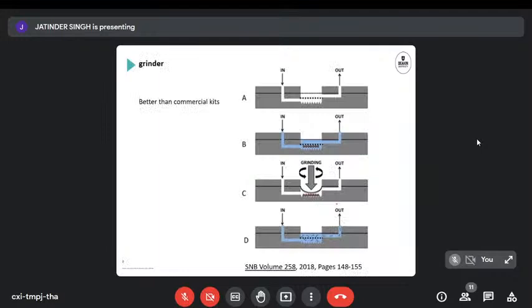What they will probably do in your medicine department, biotechnology, is grind things together. I think it's pottering that's called. I remember doing it in undergrad experiments with a weird buzzing instrument. So we put a lever in and we move the thing up and down, pretty much like a stick mixer. And it did grind all the cells apart to bits so that the cells would release their contents. Grinding has also been demonstrated on the microfluidic format by having a cell created with sharp saw teeth at the bottom.